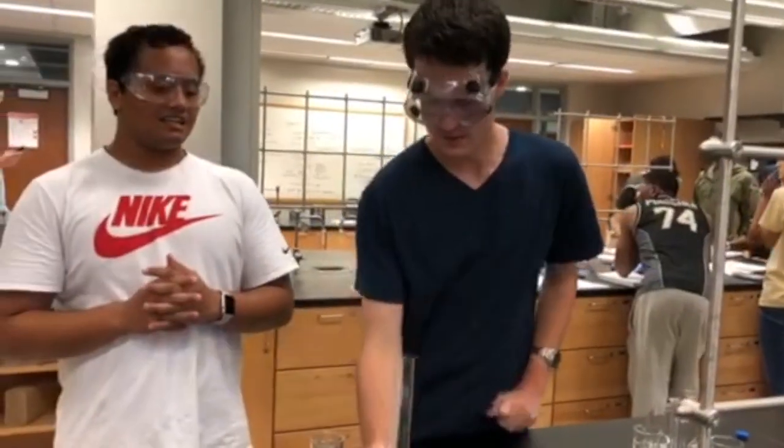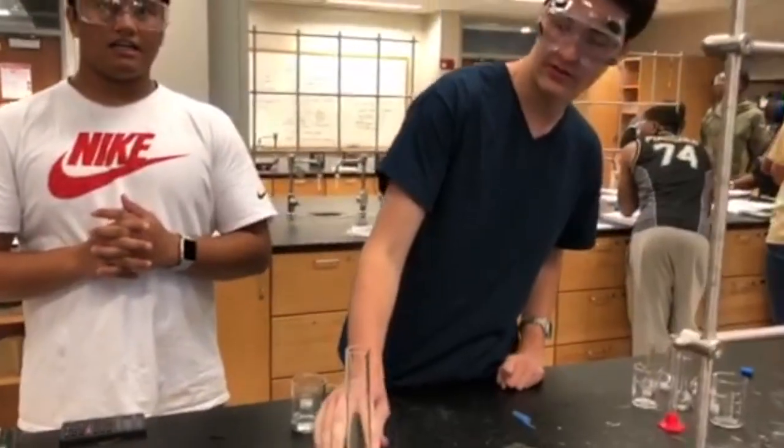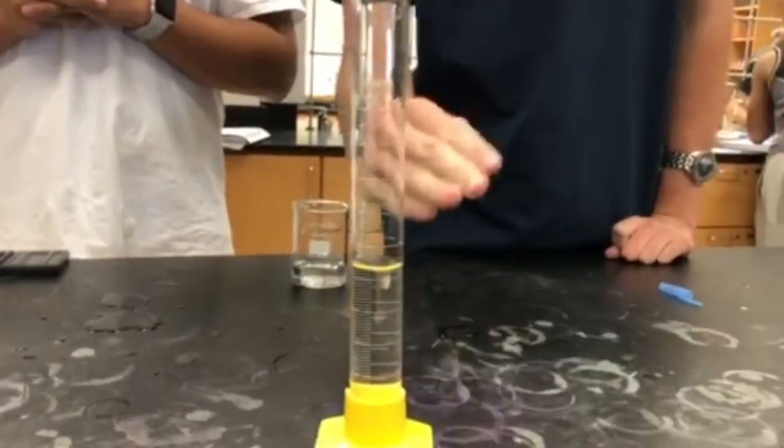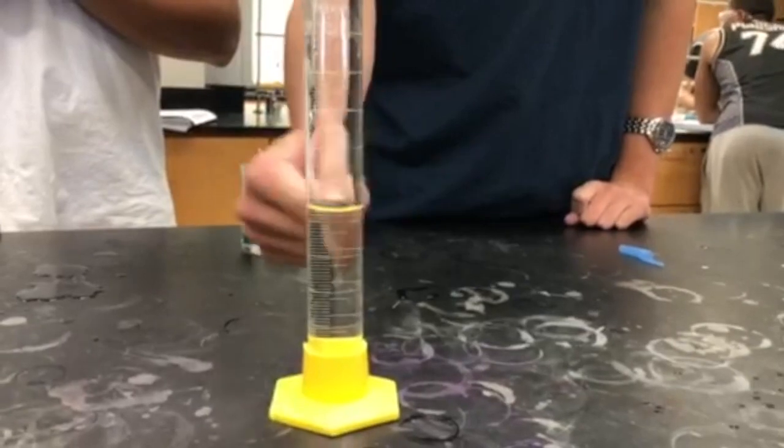It is formed by molecules climbing up the wall of the cylinder, and it's shown by a dip, and you measure from the bottom of the meniscus.